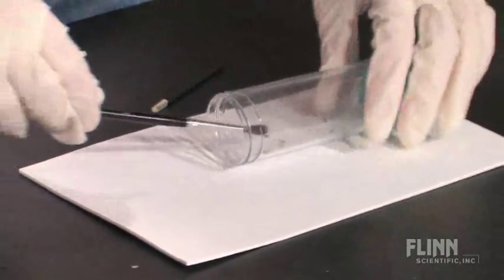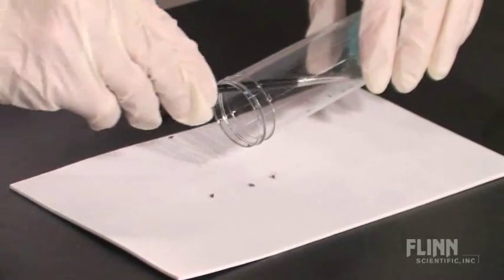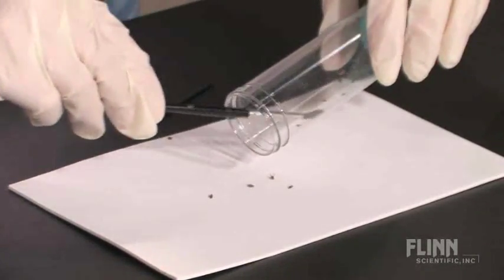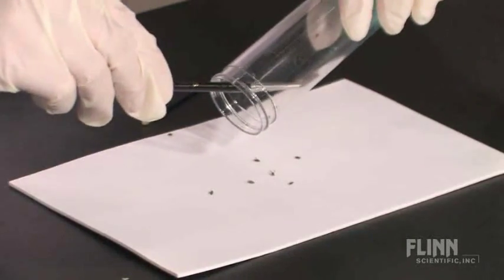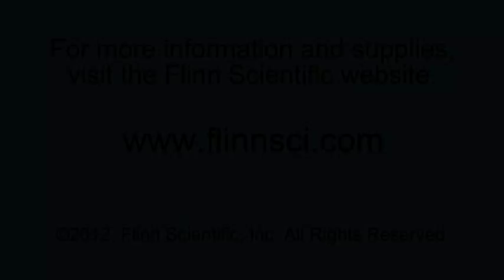Transfer the flies from the vial to a white surface using a camel hair brush. Once your flies have been properly anesthetized, they can be counted, sorted, and tallied to conduct genetic experiments.